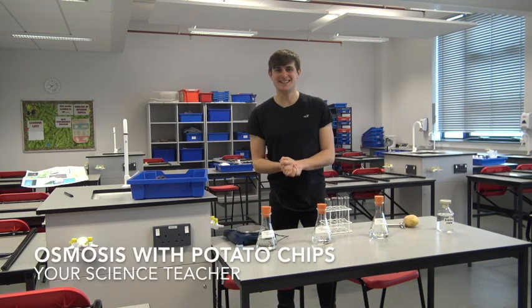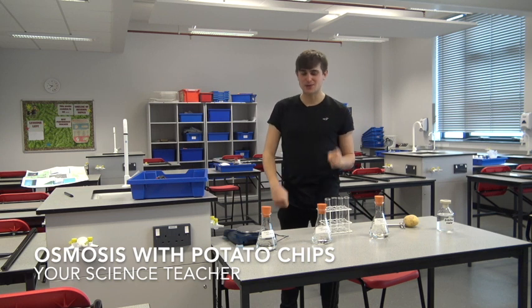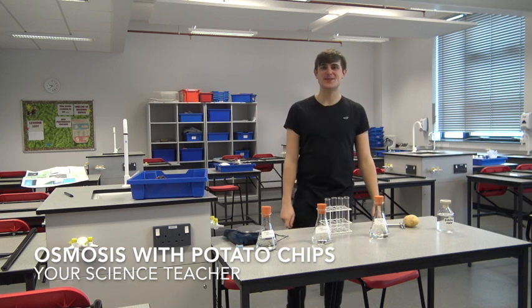Hi guys, it's your science teacher here back with another practical. This time I'm going to go through osmosis with you guys.